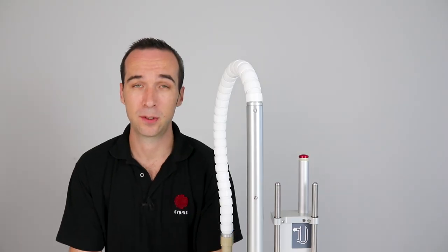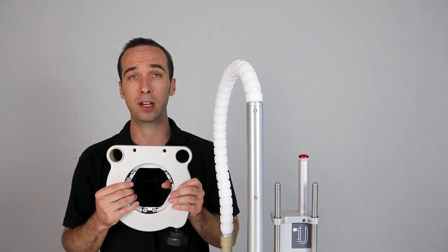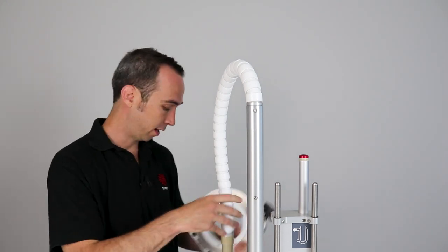The next part of the system is the vessel clamp. The vessel clamp is torque limited to ensure it can't be over tightened keeping your glassware safe.